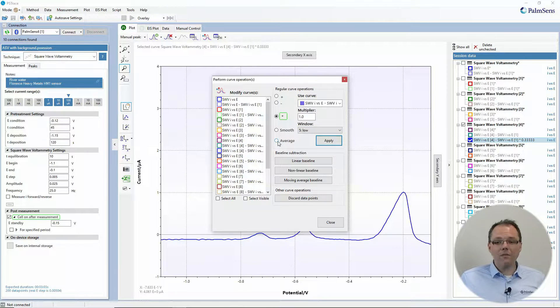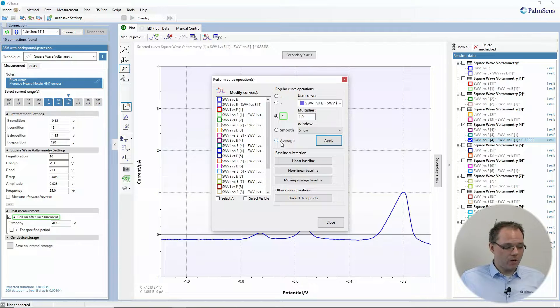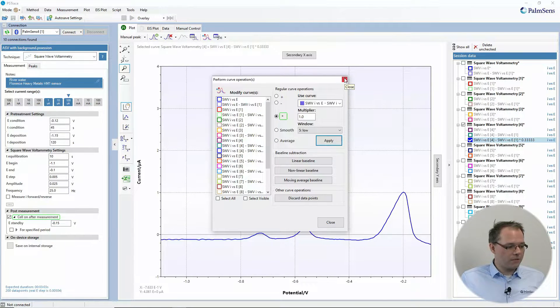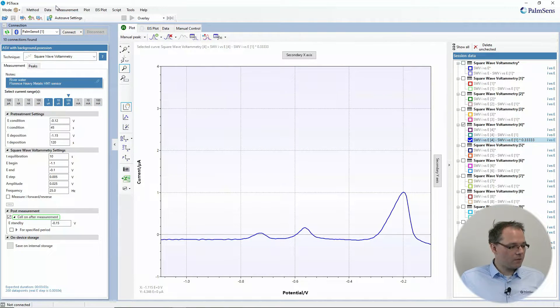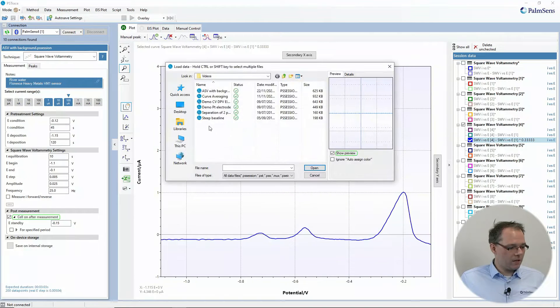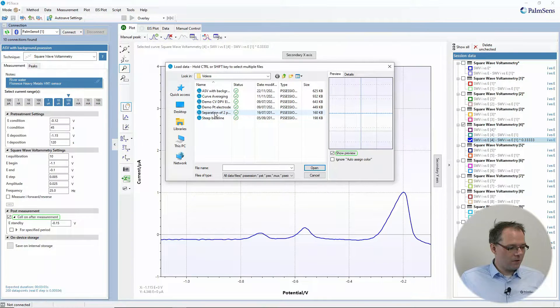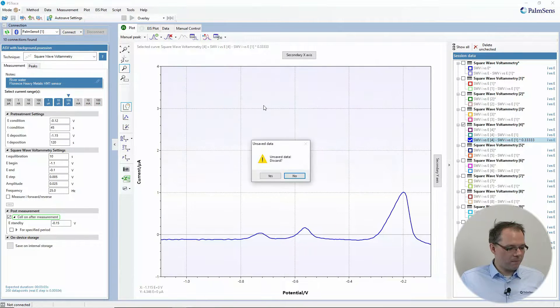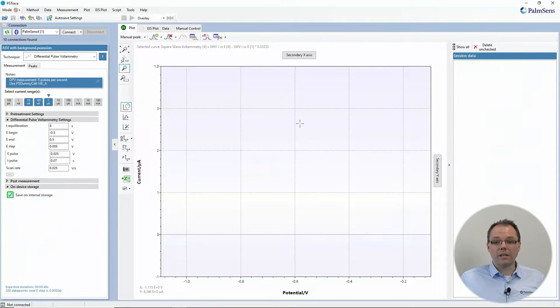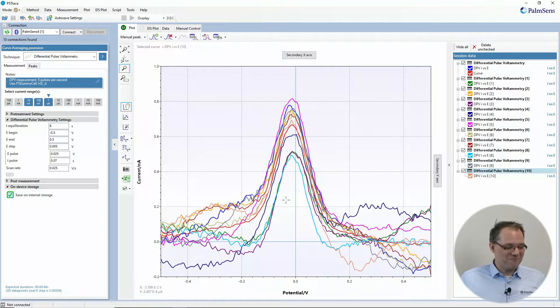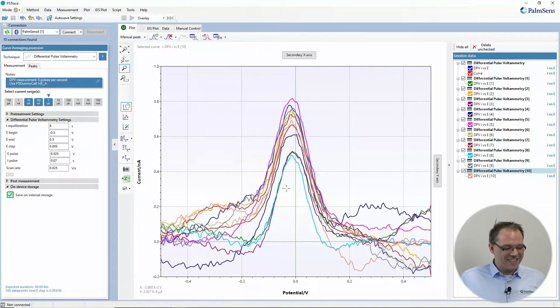You also can average multiple curves and I would like to show you that on a different curve that I'm going to quickly load. So I'm going to data, load a file, and I'm loading the one that says curve averaging. Yes, I want to get rid of my old data.